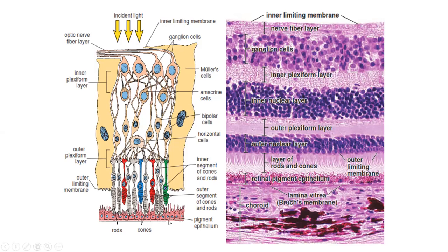This is basement membrane of the pigment epithelium and this is low cuboidal epithelium. So this epithelium has a rounded nucleus in the basal region, and in the apical region you can see brownish black pigment, that is the melanin pigment. That's why this epithelium is called pigment epithelium. And apical cytoplasmic projections are also visible. So these are projecting into the layer of rods and cones.